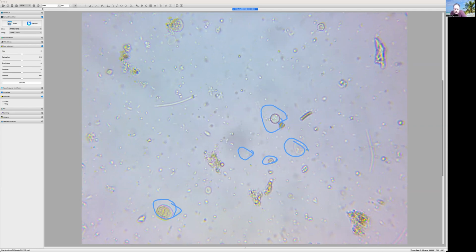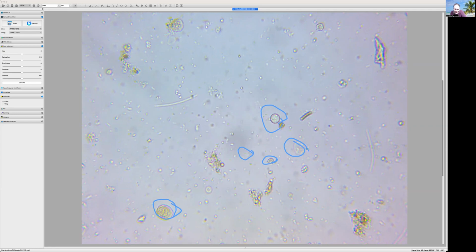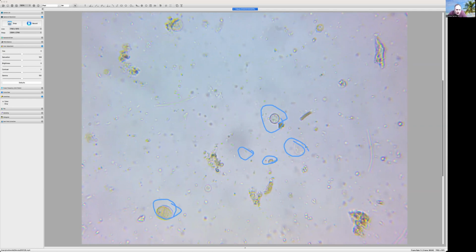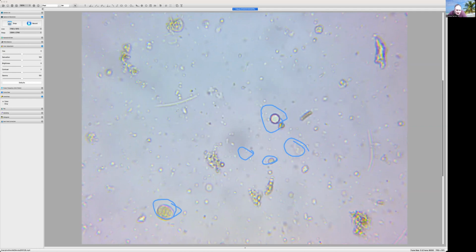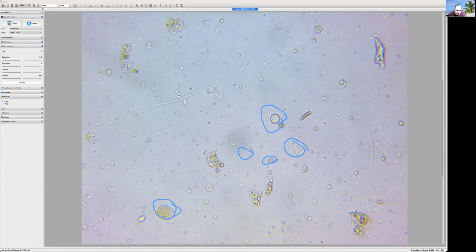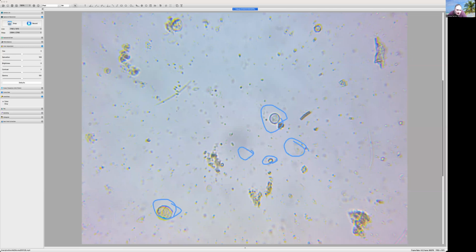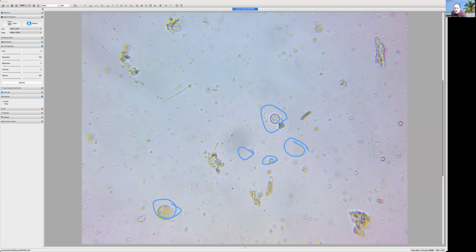Let's zoom in. Look at this flagellate. He's going around here. He's bumbling around. Let's look in on this here to see if we have a beneficial fungi. One thing I will say, I do not see septa. Possibly a septa there, but one septa maybe. Okay, so I'm not going to say that is.